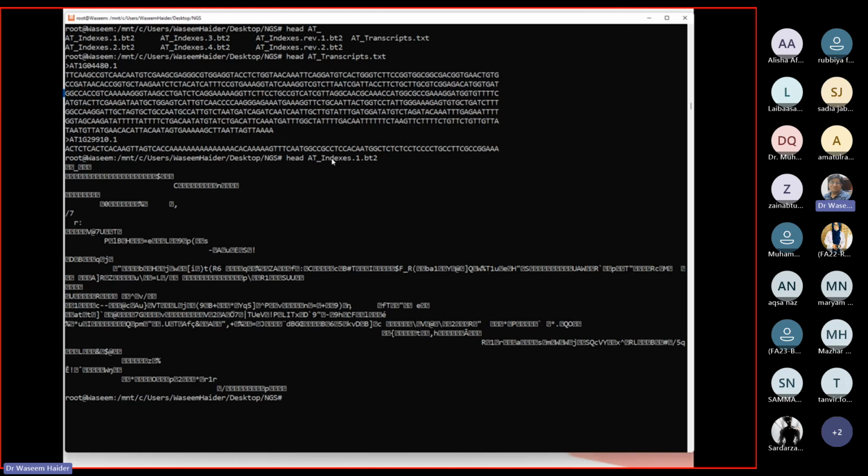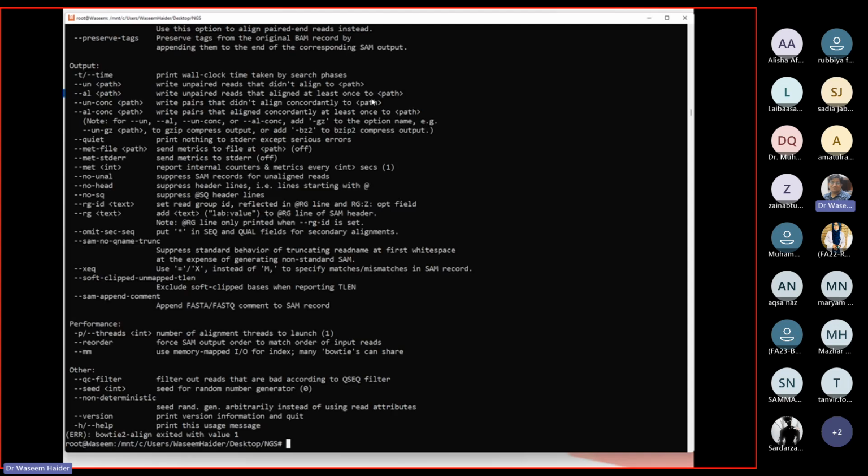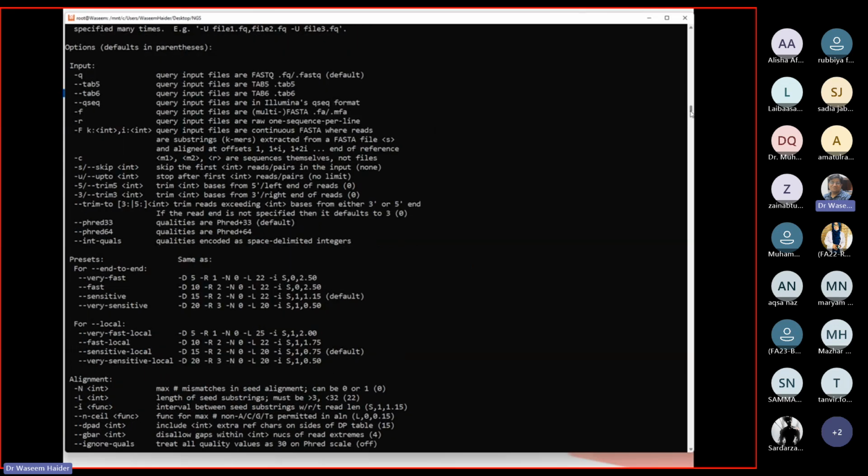And again, the search space is divided into six different sections, which makes it easier and quicker. Next, we want to run the file with the command. Where is my command? So I just write this and it can tell me the way we can do that before I open it up.